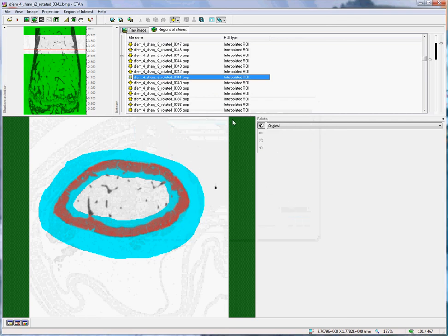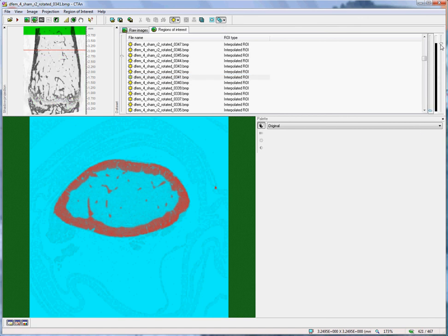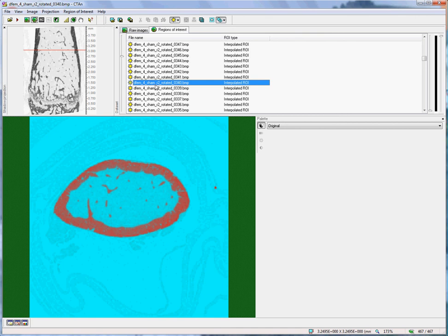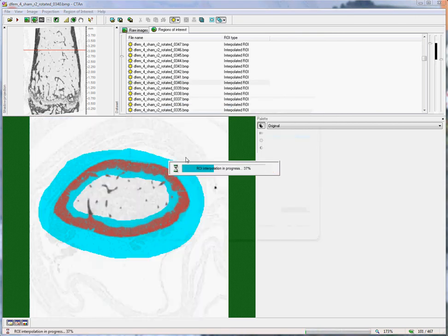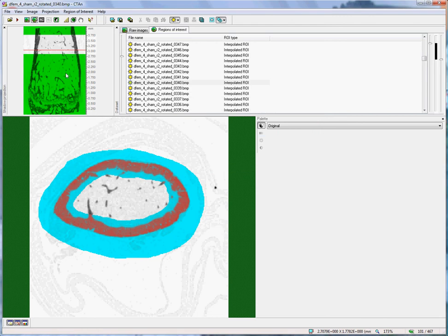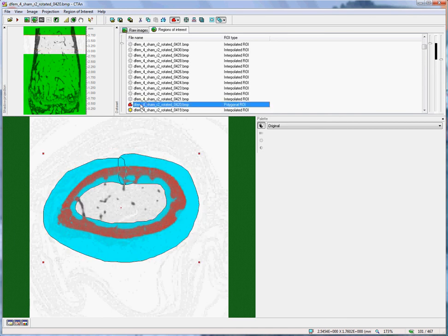This means that if I delete the region of interest, and if I reset the vertical range, I can call back the region of interest by clicking Load ROI. It restores both the vertical range and the edited shapes.